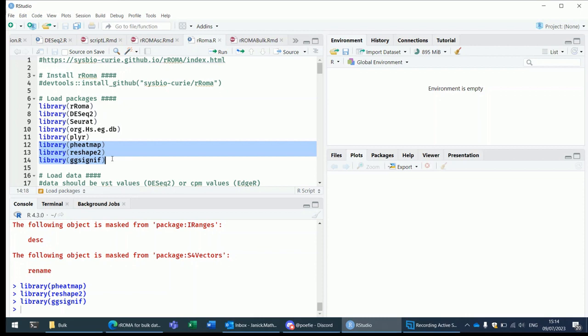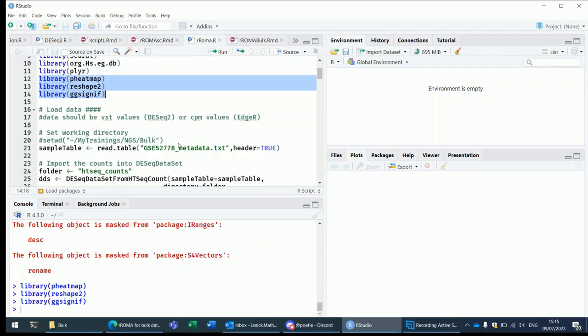It's a tool that is similar to gene set enrichment analysis tools, or tools that perform what is called functional overrepresentation analysis like gProfiler or DAVID, but it uses a different approach to find relevant pathways that are affected in your RNA-seq data. We're going to load the data.